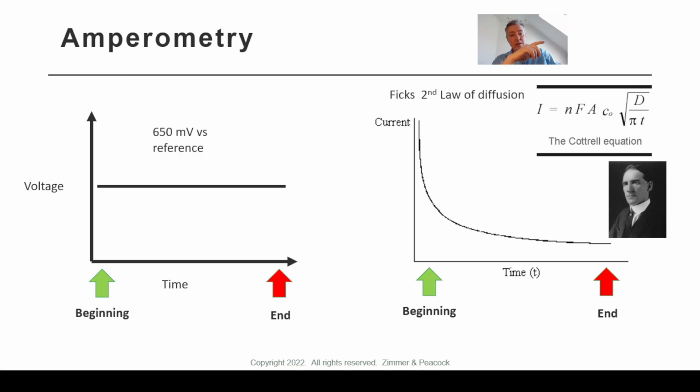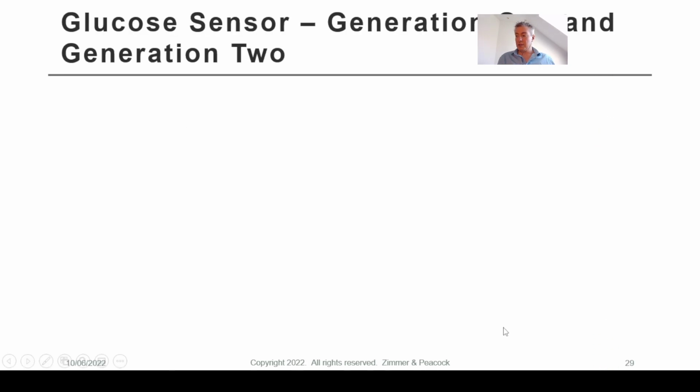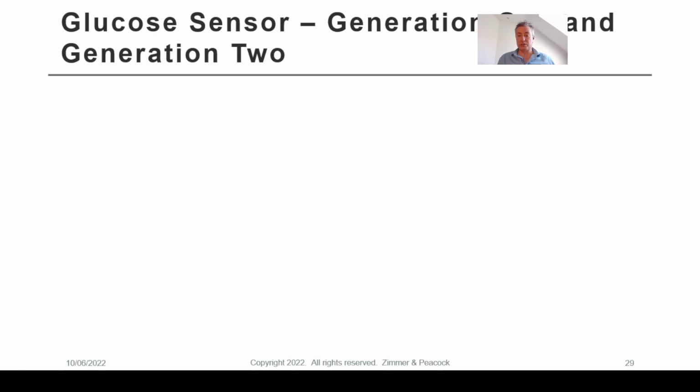It's the same reason in voltammetry, where you have the iconic voltammogram, you come up to a peak and then it starts falling down because of a depletion zone, which is diffusion controlled. And the same thing can happen in amperometry. If you just have, let's call it a glucose strip, and you turn it on at 650 millivolts, the signal will jump up and then start falling with time as you start to consume all the analyte. So you have a sort of initial jump, and then the current falls with time, and it's governed by the Cottrell equation. And the current is proportional to the concentration, so it's a useful analytical technique. As I say, it's most widely used in the glucose space.